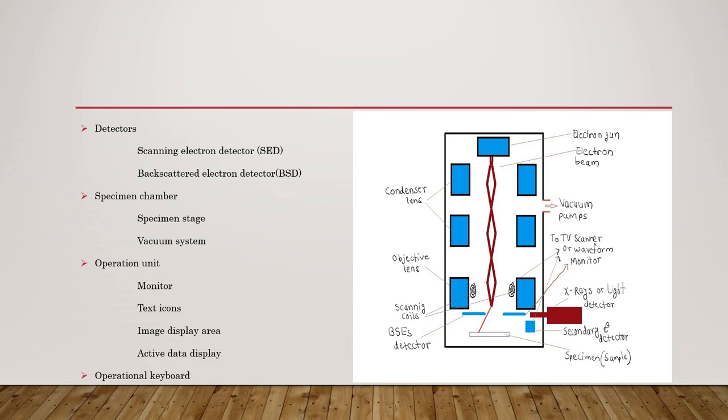Second is the backscattered electron detector, that is BSD. The BSD is mounted below the objective lens pole piece and centered around the optic axis. As the specimen surface is scanned by the incident electron beam, backscattered electrons are generated, the yield of which is controlled by the topographical, physical and chemical characteristics of the sample. Both compositional or topographical backscattered electron images can be recorded depending on the window of electron energies selected for image formation.